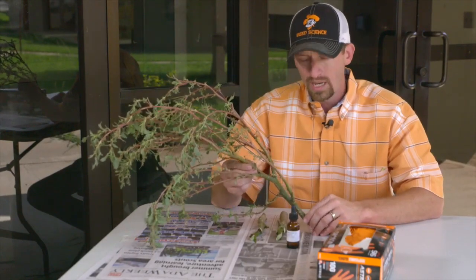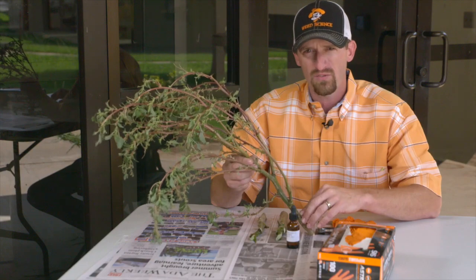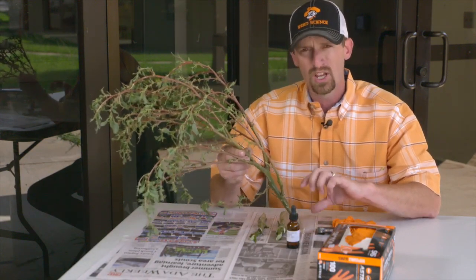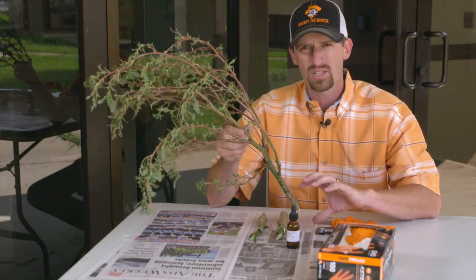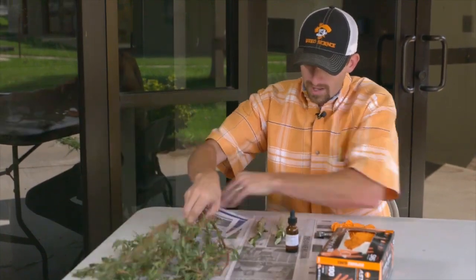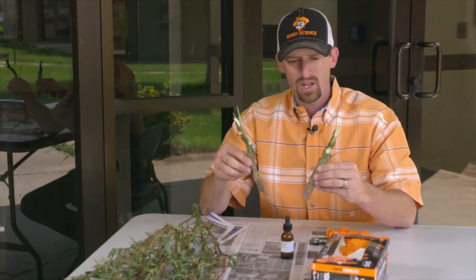I have here in my hand a pigweed plant. Really, any species of the amaranth family will work for this, because we know that all amaranth species do accumulate nitrates in the lower part of the stem. So you want to go out in the field and sample some of these plants. I have a couple of stems prepared and ready to be split so we can test the reagent.